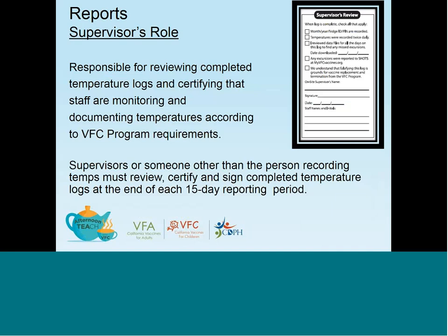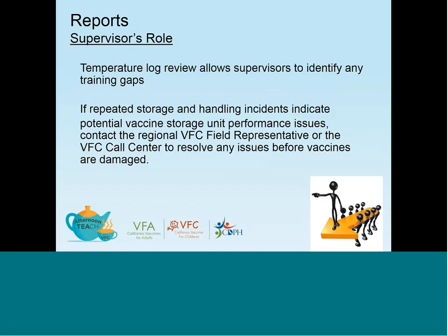Reviews should go quickly unless there are repeated temperature excursions. Reviewing temperature logs allows supervisors to identify any training gaps. But in order to do this, supervisors must be knowledgeable about proper temperature monitoring.